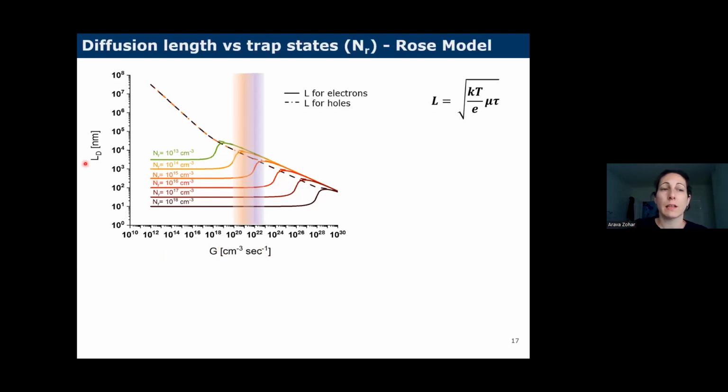The y-axis represents the diffusion length of the minority and the majority carriers, depending on dashed or full line. And I assume for each time that I send it to iteration, a different amount of defects located in my defect state. And what I found here is that whenever I have the majority carriers, and this is very low intensity, so whenever I have a lower illumination, basically, as I add more carriers, the diffusion length of the minority carriers always decays, always going down.